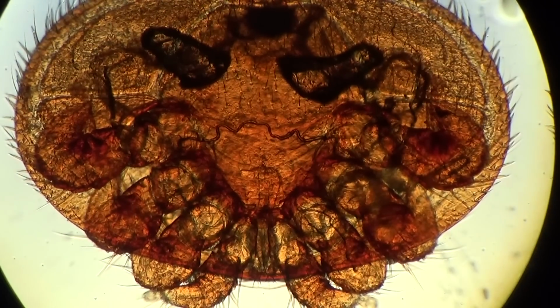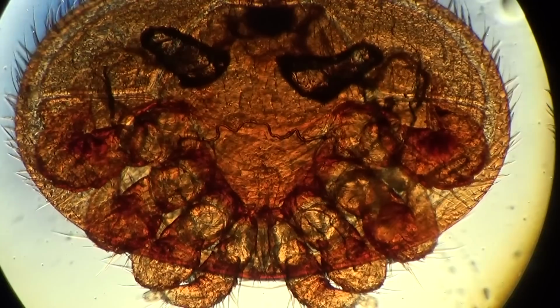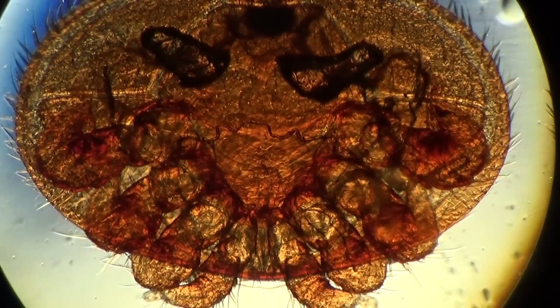So the whole life cycle is from 8 to 10 days for the female and 6-7 days for the male.